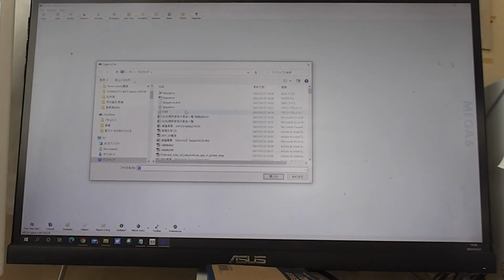Yes, so by using MEGA software, could you please open the file? Yes, so after alignment we can get the sequences in this software based on FASTA format. Could you please select the file?